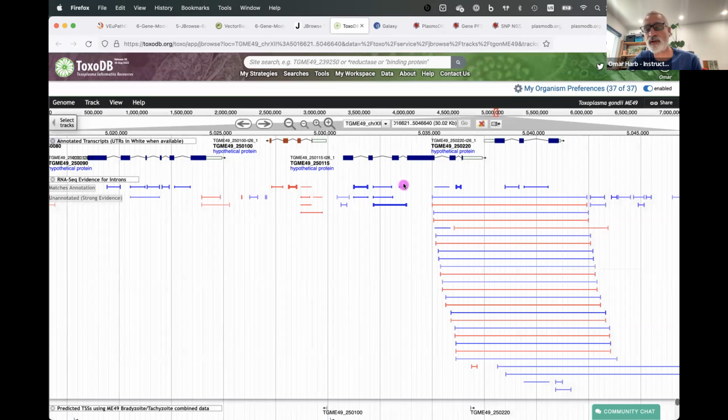So then this starts to give you an idea if you're trying to determine which one of these introns, which one of the gene models, is potentially most abundant. If there are multiple gene models, this could be a useful metric, and you'll see how that's useful in the next thing.